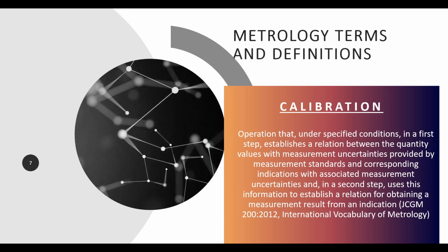Calibration is the comparison of one known reference to an unknown reference, and it's only for that one specific point. That is that calibration. So we're taking our ice bath here and we're measuring it with different probes, but that is the comparison. So calibration is just the comparison. It is not the adjustment.